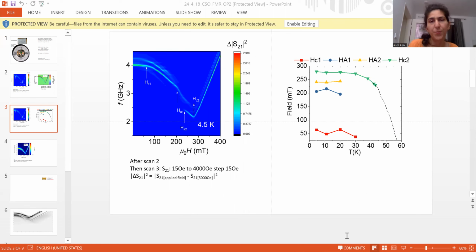So this is a very detailed PowerPoint, and in the end, this PowerPoint I converted to a presentation, because in a presentation you still cannot present so many results, so you select. But such a long detailed summary of results helps you and already prepares you for some nice presentations, for manuscripts, and for discussions.